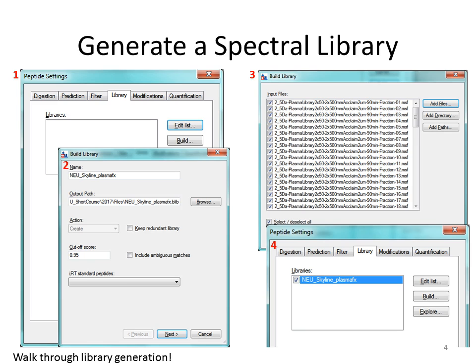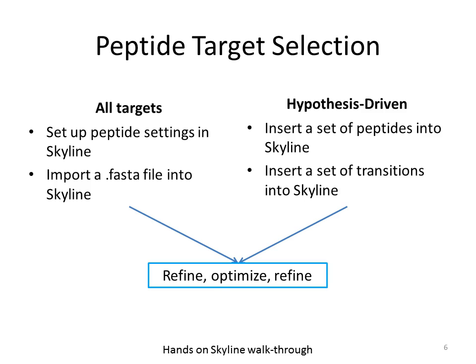These are the exact ones you're going to get. I'm sorry that you don't have access to them right now. And then you would click add files. And then under peptide settings, library, you would click the box and it should be there. Or at least it'll start building. So that didn't go as smoothly as I thought, I'm sorry. But back to the presentation.